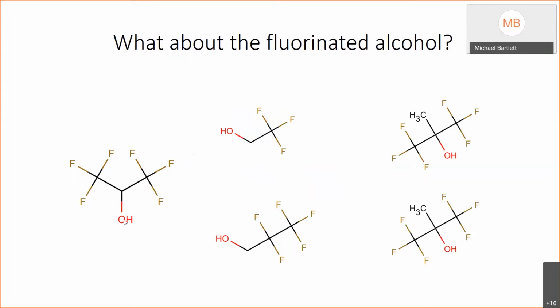So what about the fluoroalcohol? Again, we spent a lot of time early in my group focused all in on the ion pairs. And at one point in time, I finally asked, this is the question: what's the fluorinated alcohol doing here? And is there anything else we can use besides HFIP as a fluoroalcohol? And would that gain us anything?